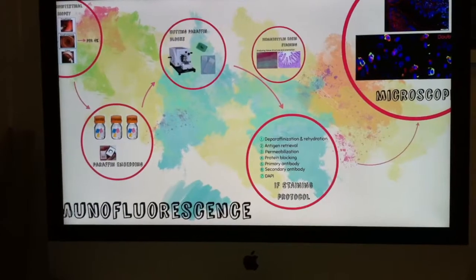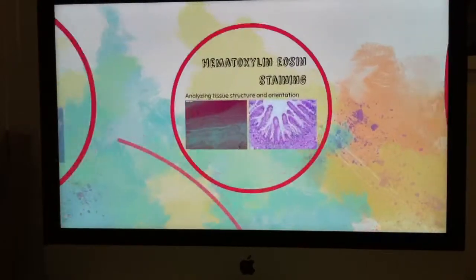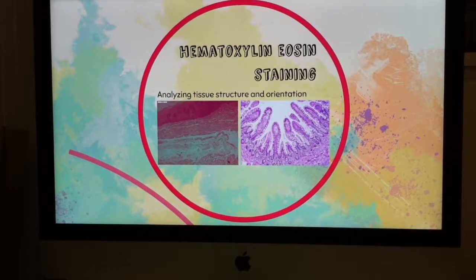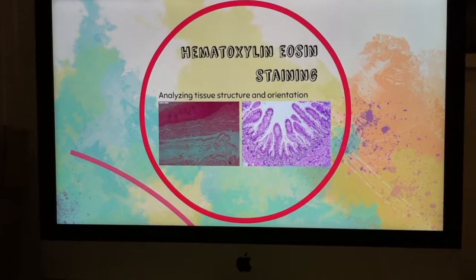Now the tissue is ready to perform any kind of immunofluorescence staining we decide, but first of all, we have to verify that the structures of the tissue and the orientation during inclusion have been done properly. So for that, we will perform a hematoxylin and eosin staining.